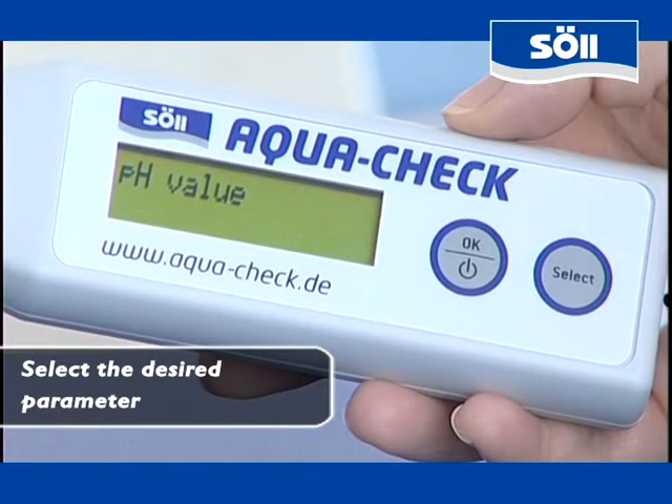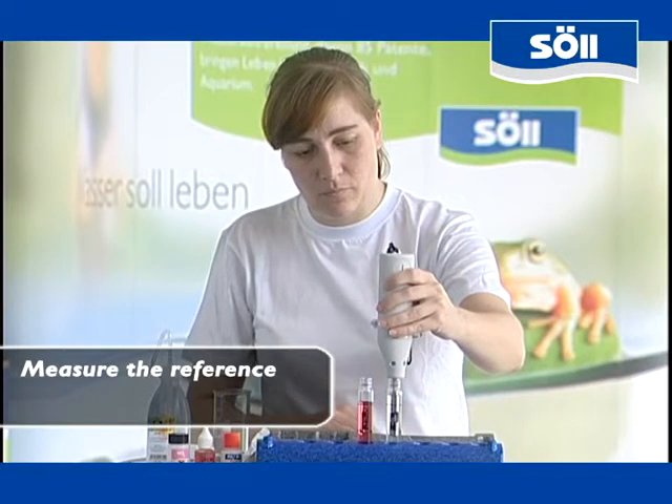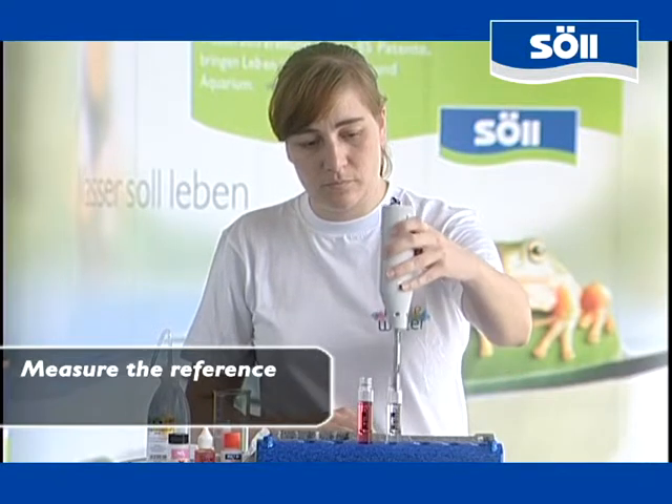First of all you have to carry out the reference measurement. Insert the measuring sensor of AquaCheck into the untreated test water. To prevent air bubbles on the lens of the sensor, lightly stir the liquid.